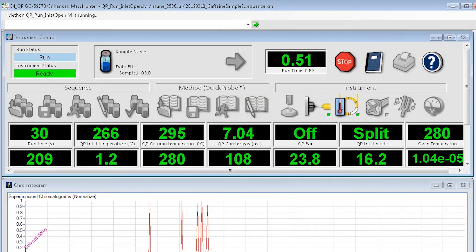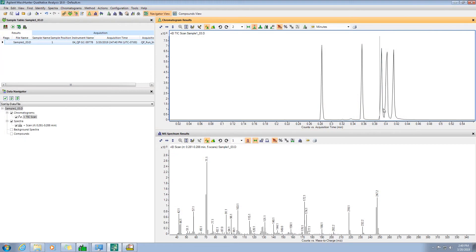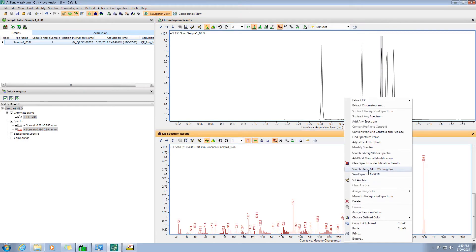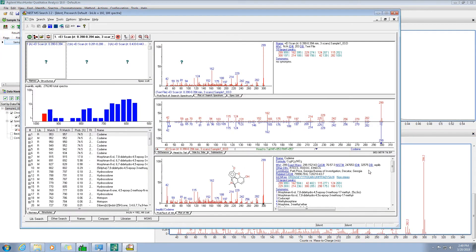And that's it. You have results in under a minute. You can see how I'm doing a quick NIST library search to identify names and structures, even at the isomer level.